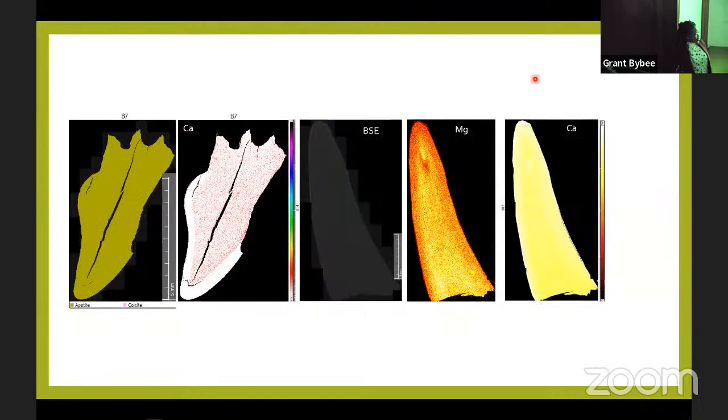And this interesting one, this gentleman also gave me, apparently analyzing tooth samples. So here you can see, this is a tooth, apparently a human tooth. Because the tooth is mostly made up of apatite, it's calcium and phosphate, so it gives us apatite, the mineral. But you can see the zoning from the calcium. So the calcium rich outside, and then here will be more magnesium rich as the inverse. So this was actually the more phosphate inside, the calcium on the outside, right?